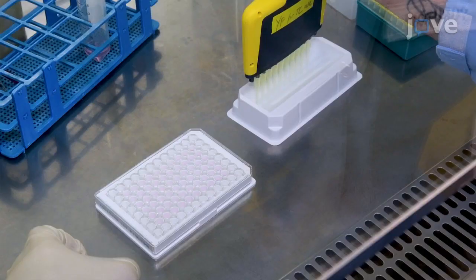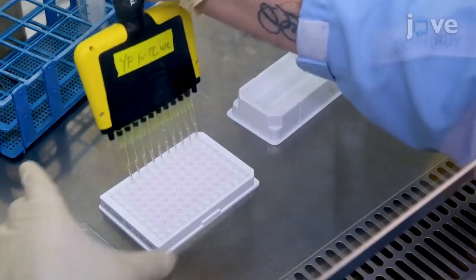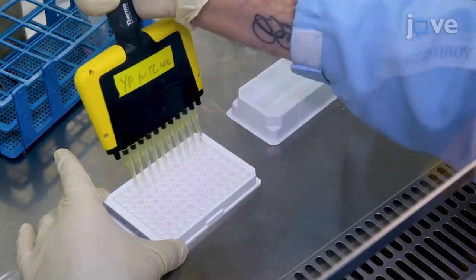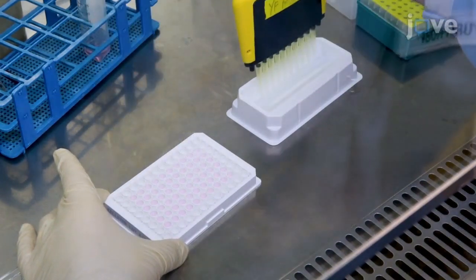There is a growing interest in the development of modalities that efficiently target protein-protein interfaces. We envision that our eIF4E-eIF4G PPI assays will help in fostering these strategies and validate them. This assay would provide an optimal primary screen for hit-to-lead optimization of eIF4E-eIF4G inhibitors.